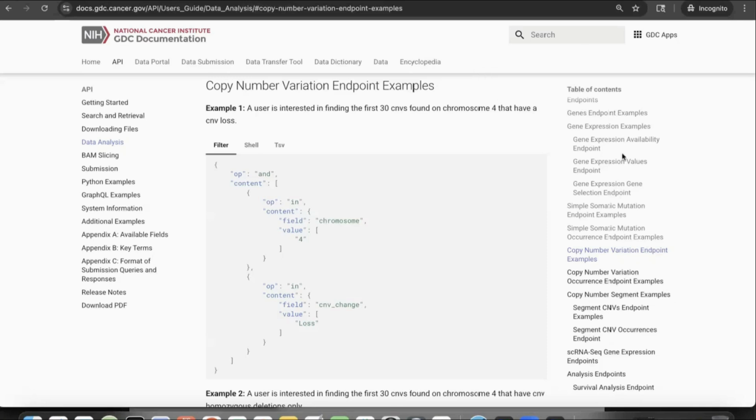All right, thanks, Shin. And now getting to the API part. I totally forgot to say underscore mapping when I was typing that out, but you seem to have figured it out, so thank you. What if I want to get the CNVs over a particular non-coding region or locus? Can I specify coordinates in the payload?